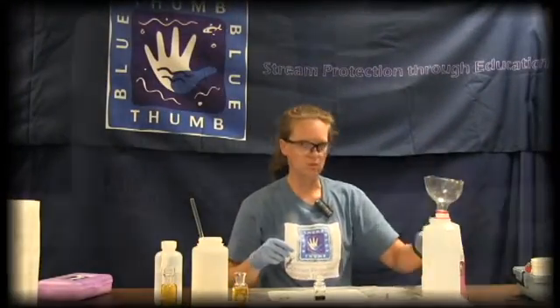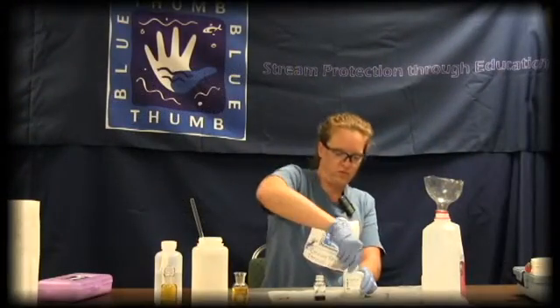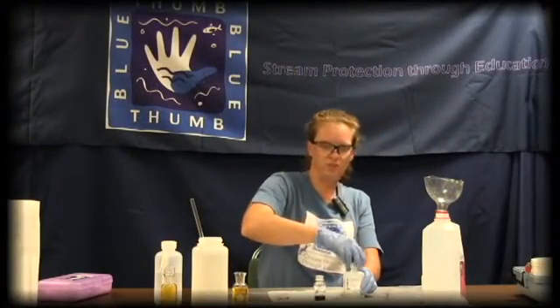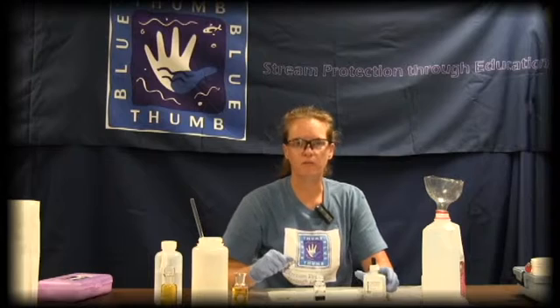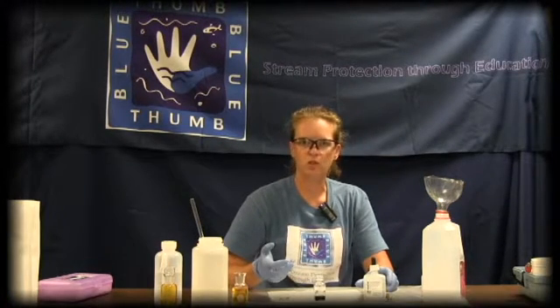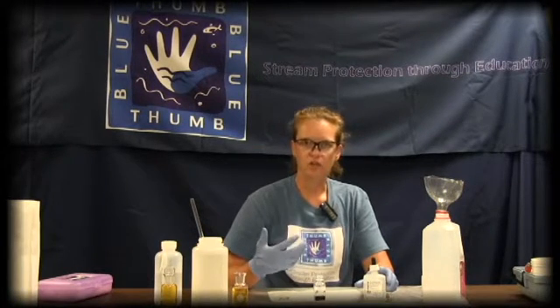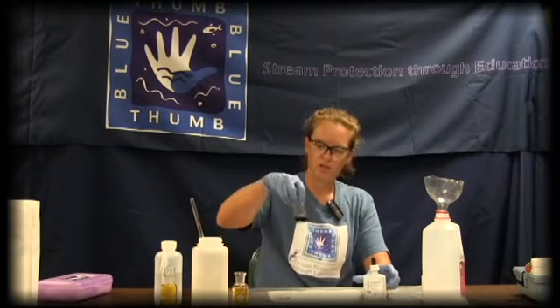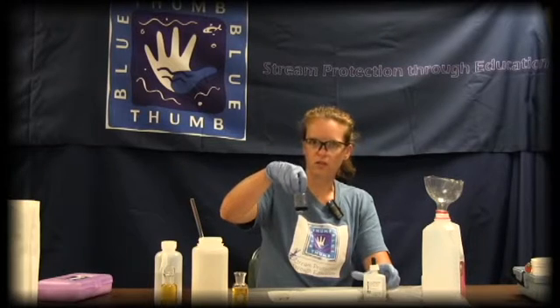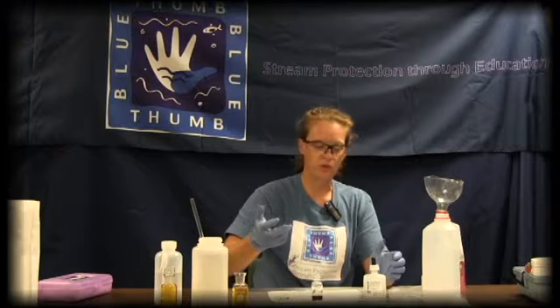Then use the sodium thiosulfate — also child-proof — and titrate with it. Titration means adding a drop of something and swirling in between each addition until you get a color change that stays. Our color change is going to be from this inky dark blue-black color until it is completely colorless. That will be our endpoint — our stopping point.